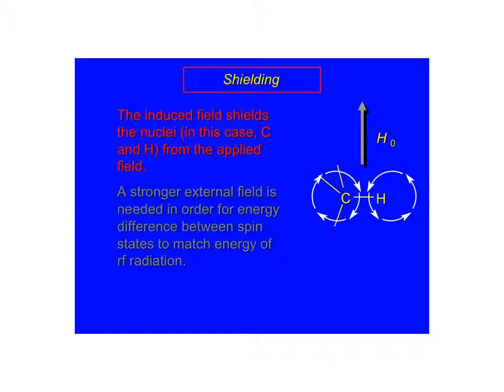And, oh, I didn't point it out, but RF stands for radio frequency. They just always use the term RF in NMR. So that's for radio frequency. That's the part of the spectrum for NMR.